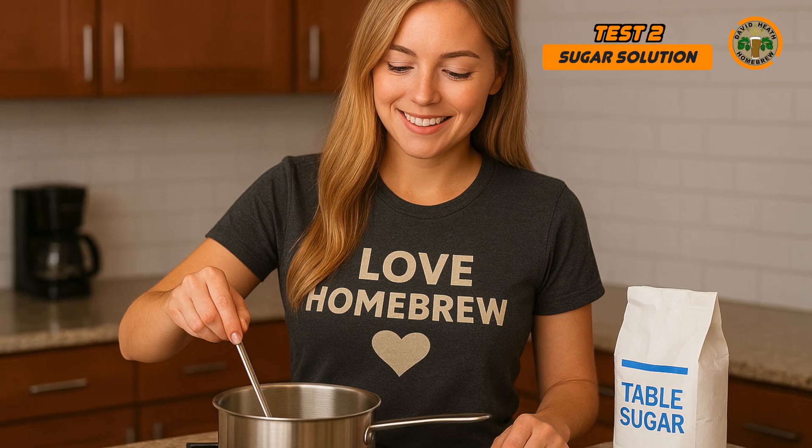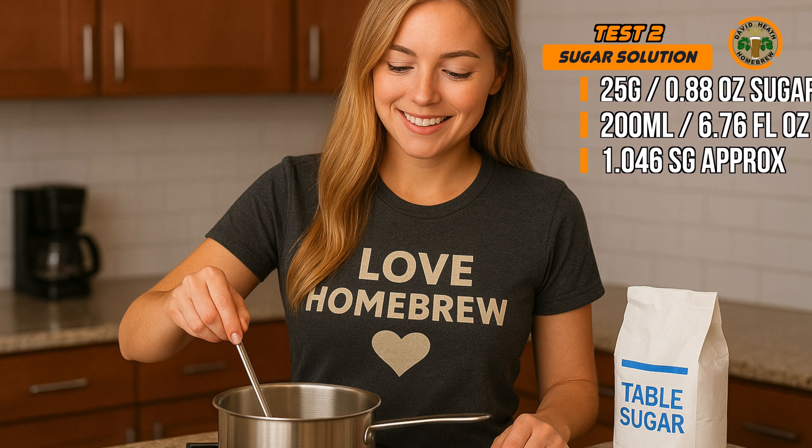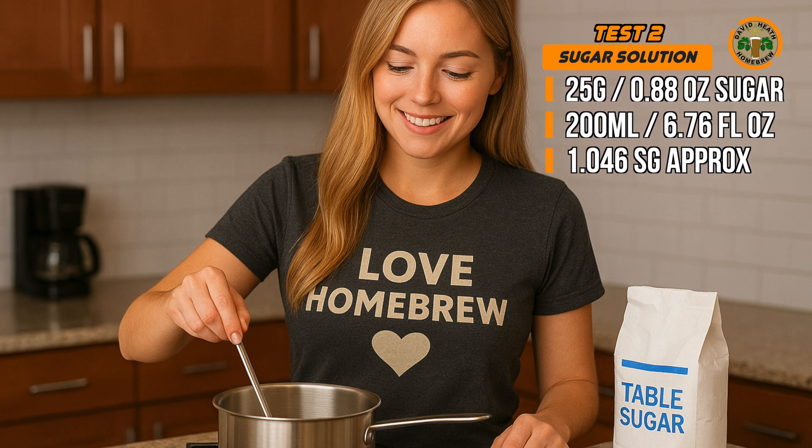The second method is to test with a known sugar solution. For example, dissolve 25 grams of table sugar into 200 millilitres of water — that's the equivalent of 0.88 ounces of sugar and 6.76 fluid ounces of water in imperial measurements. This will give you a sugar solution with a known SG of around 1.046 at 20 degrees Celsius or 68 degrees Fahrenheit. You can then take a reading; if your hydrometer is within plus or minus 0.002 of that, it's working just fine. However, if your hydrometer is out by more than 0.005, it's worth either replacing it or always adjusting your readings — just remember to be consistent.